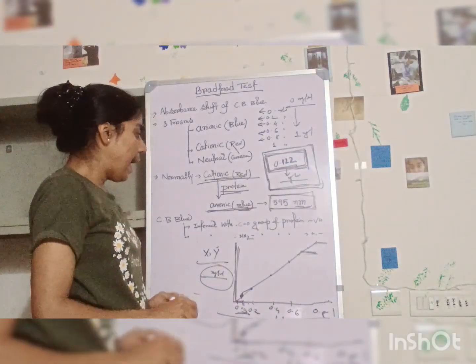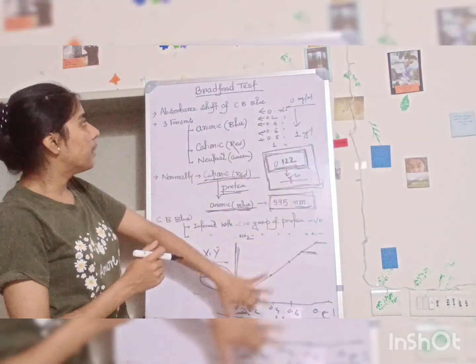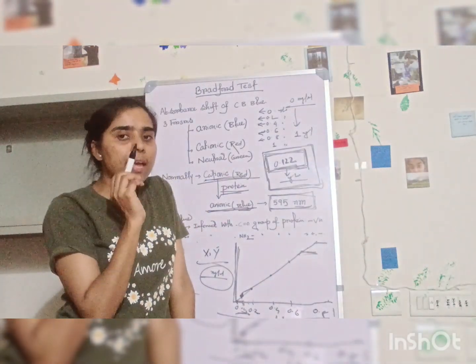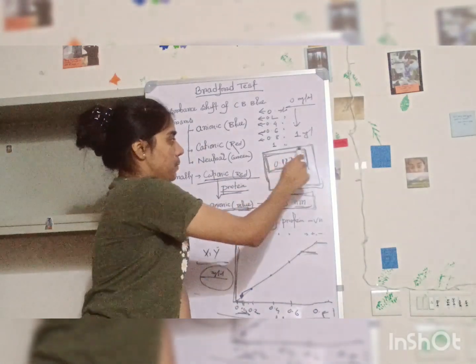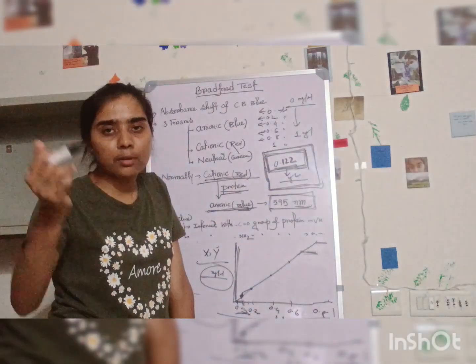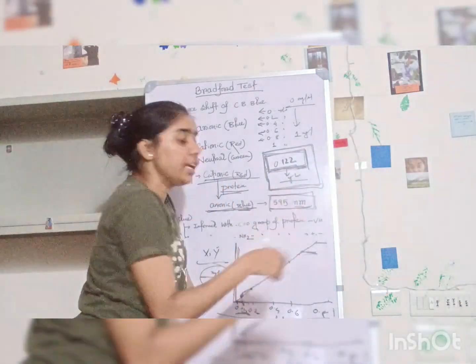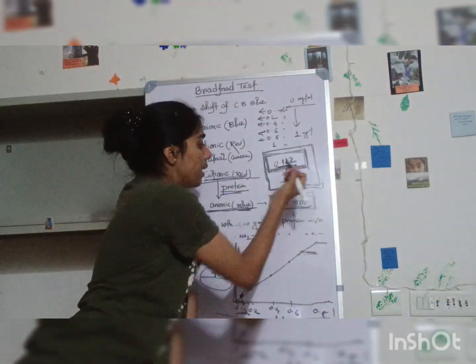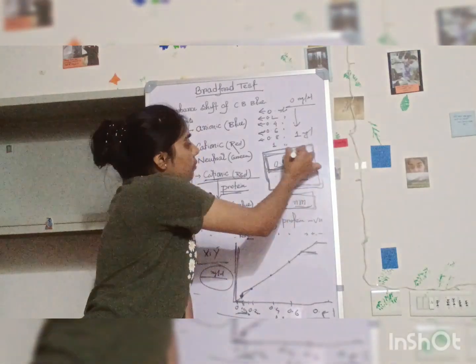That is one thing. And this is the theoretical part of the Bradford test. Next, with this video, I'll attach another video where I experimentally show you how we can get this absorbance value. In my video, I got up to this level, the absorbance level. But if you have any confusion or doubt about how you can get the mg per ml, that is the protein concentration, just let me know. I'll show you how you can do that.